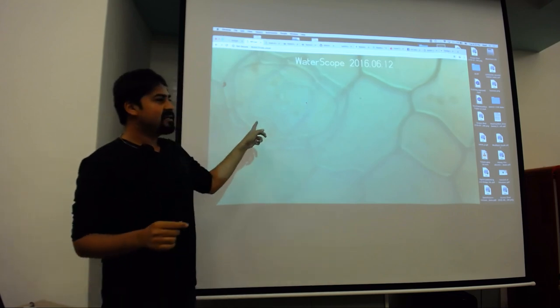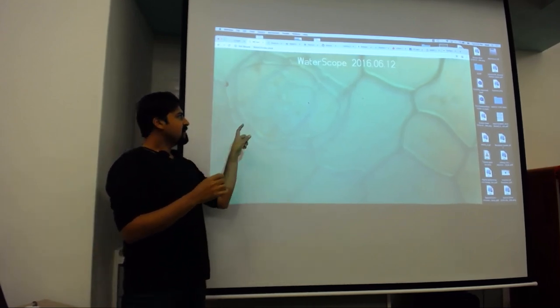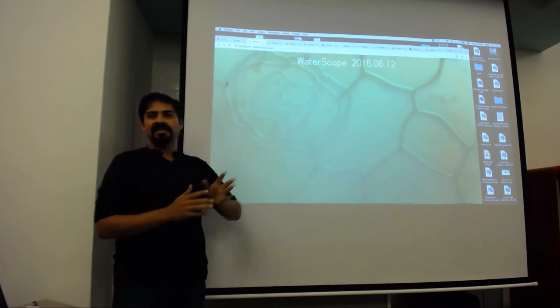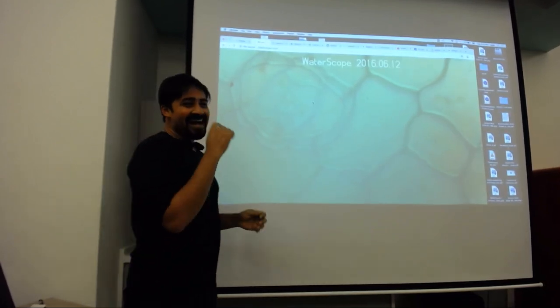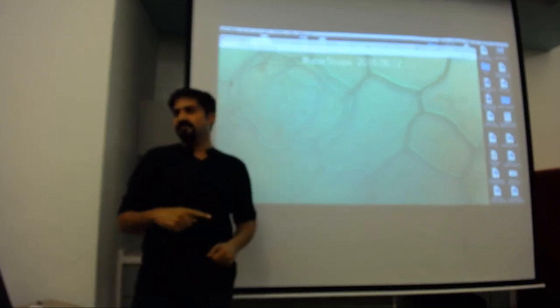All right, and apparently, I think this is where leaves breathe. Is that right? It's a little device. Stomata, thank you. Yes, these are stomata, I have just learned. This is how leaves breathe. I've completely forgot this. All right, try it.